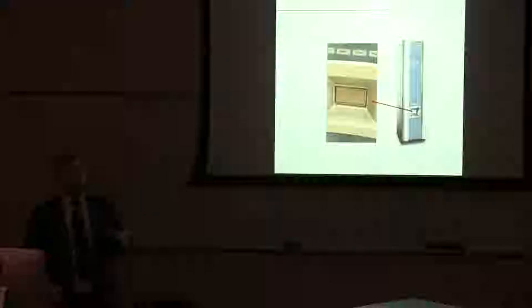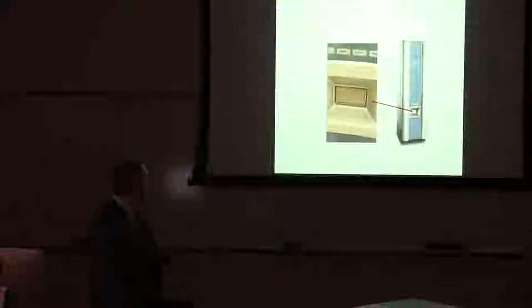So very straightforward sample preparation. Once you've spotted all of your samples, you let them dry, you're then going to load them into the instrument. And this is basically the door where you would load your plate.